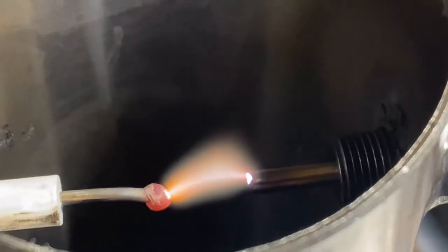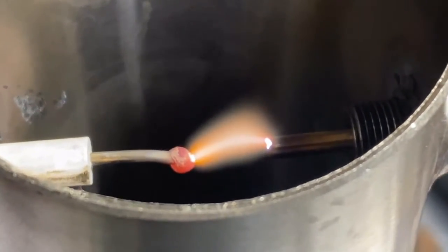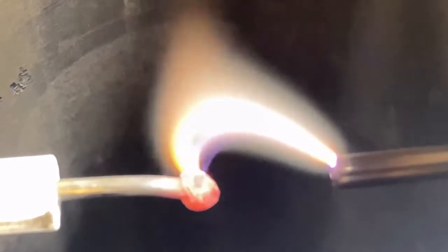For the Birkeland-Eyde reaction to work properly, we need to promote the highest temperatures possible. That is why I did not use the spark plugs. We're going with these electrodes so we can get that red-hot metal and ensure we have good 3000 Kelvin areas in the process.